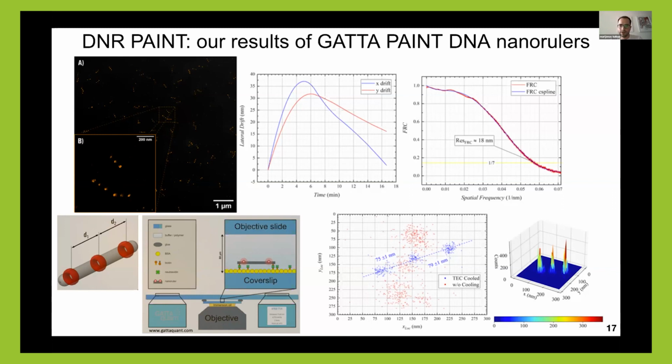And here in the bottom, I'm showing you how results would look if we have no cooling on the industrial CMOS camera. That would be these red dots. They are kind of making 3 clouds. You can still identify them on the ruler, but when you cool the industrial CMOS camera, they are resolved so much more nicely. And that just shows how important it is to cool down the camera and to have low noise to detect them reliably.